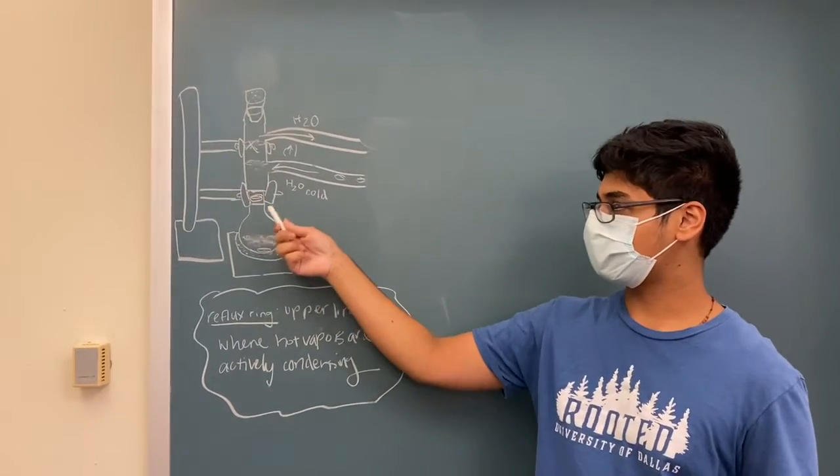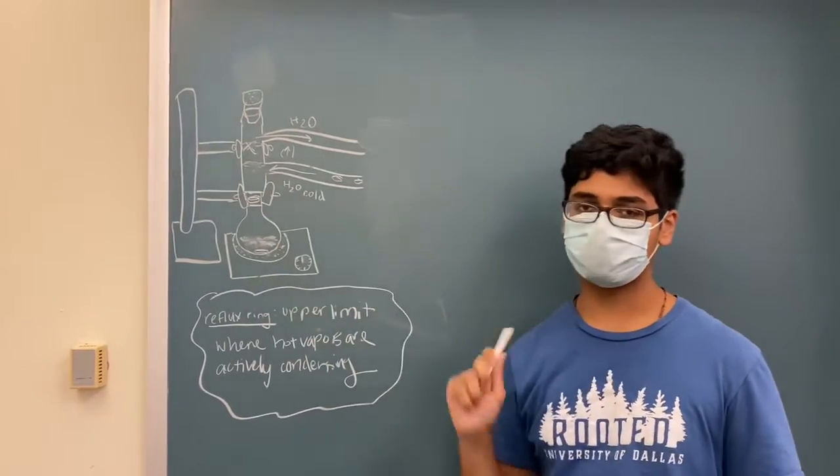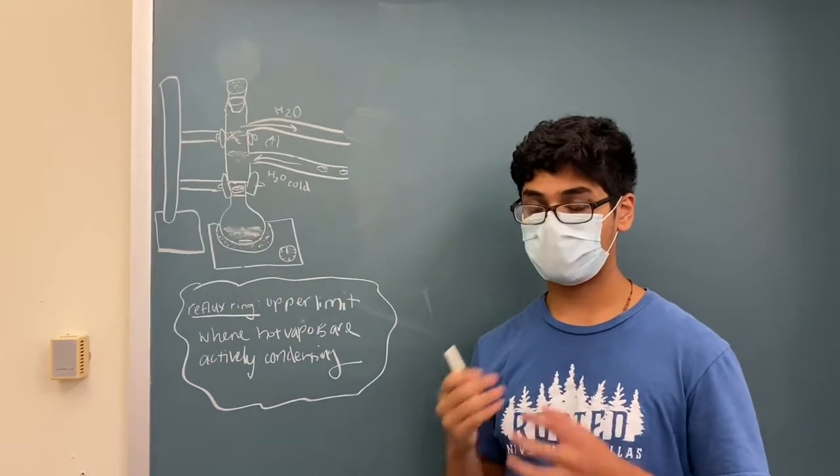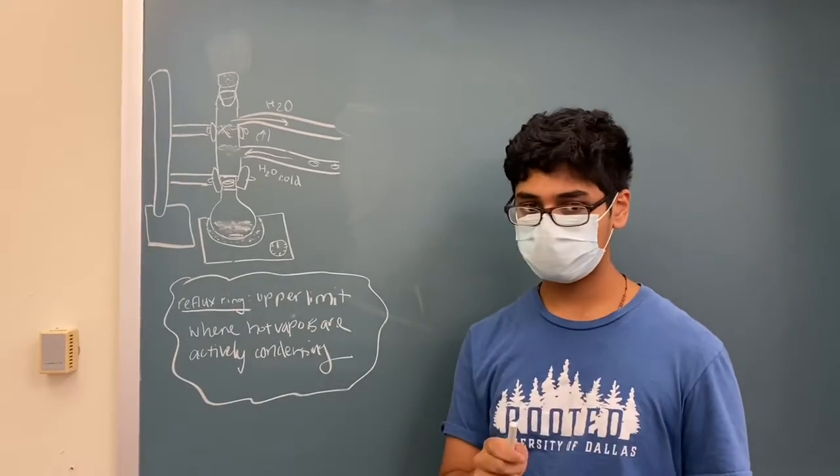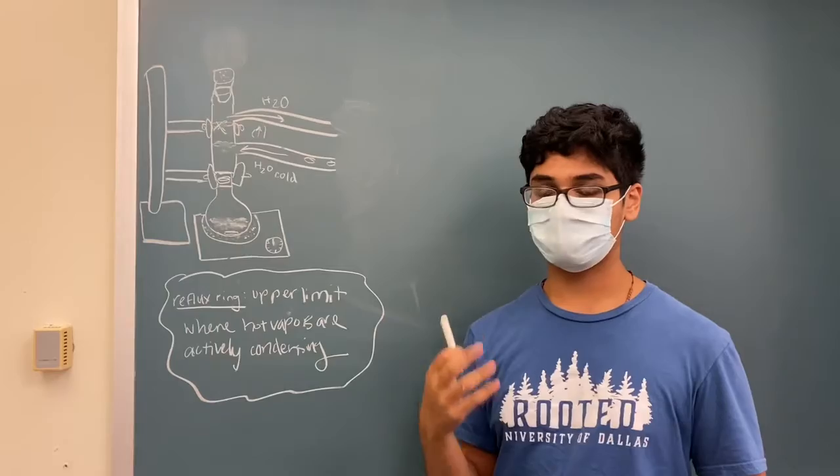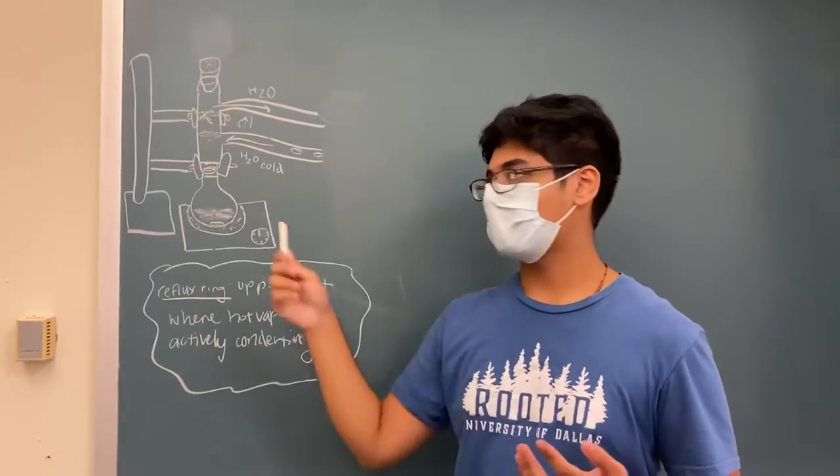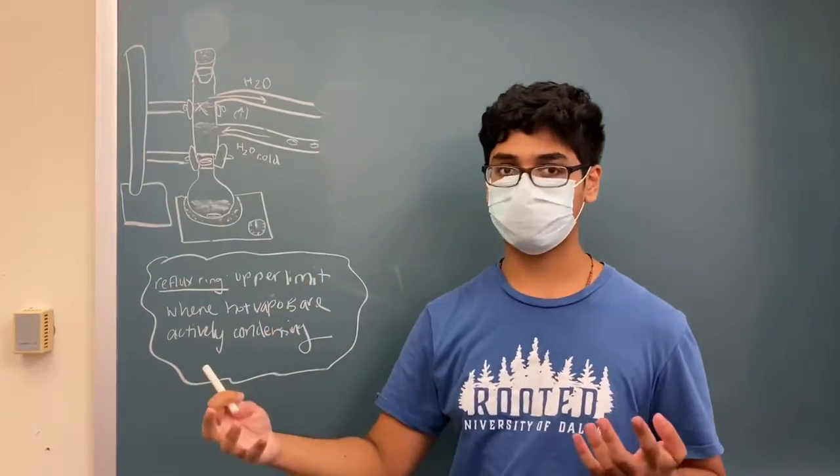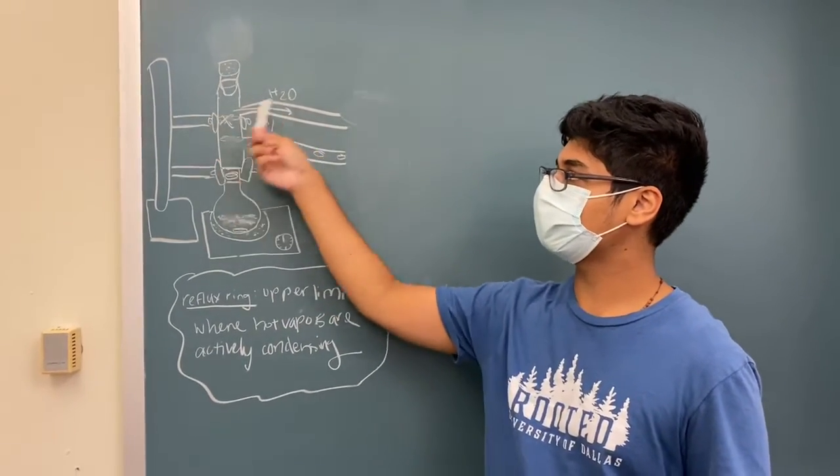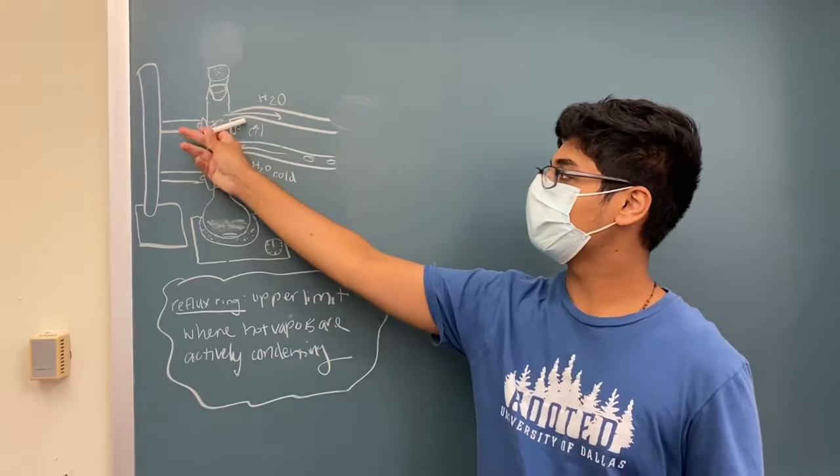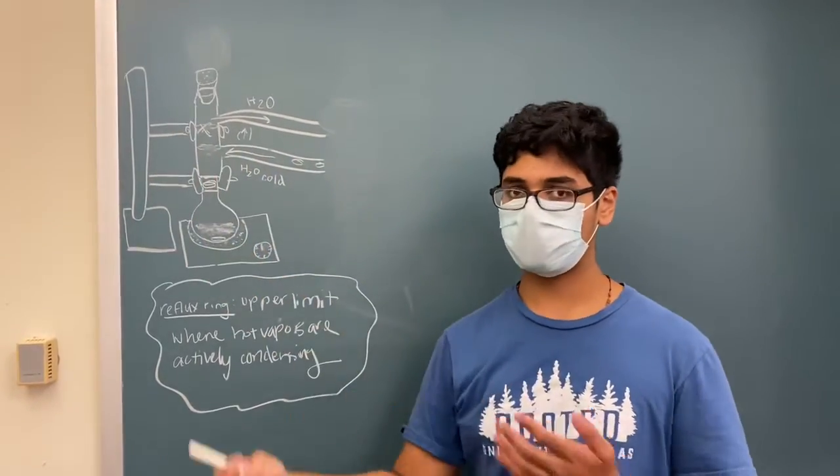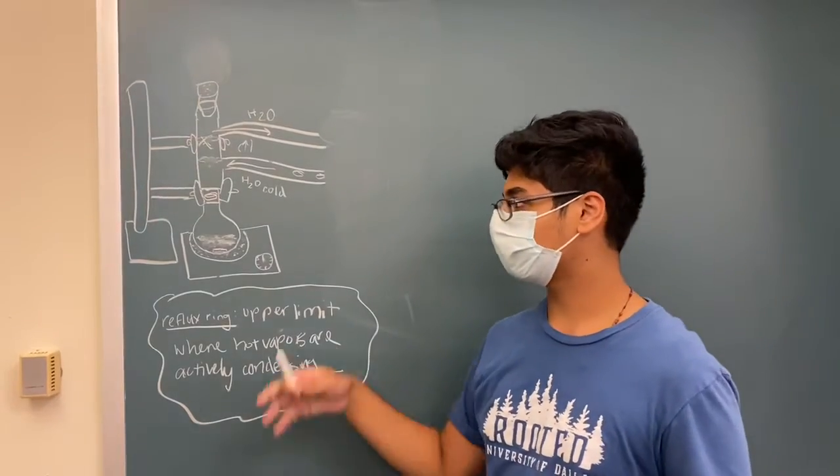Next you should attach the round bottom flask to a vertical condenser column with a metal clamp so that it allows for greater structural support and integrity. Do not use a plastic clip because this is going to be a heating experiment so there's a very good chance that it will melt and the vapors can escape and possibly ignite. Once you attach it with the clamp, attach another metal clamp around the middle part of the vertical condenser column and attach that to another ring stand to allow greater support and stability for the whole apparatus.